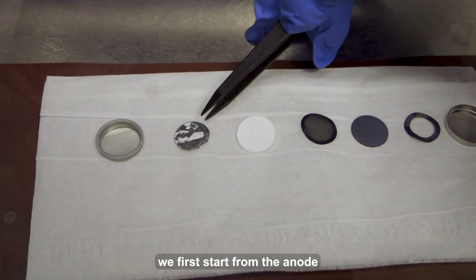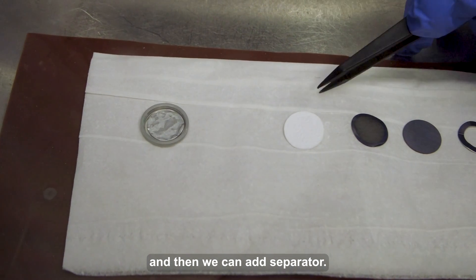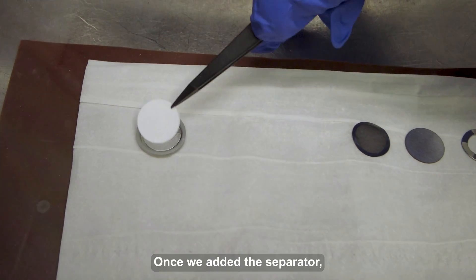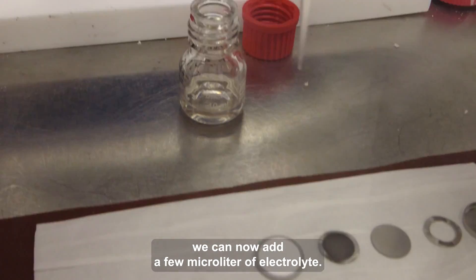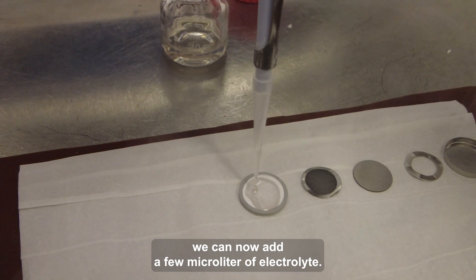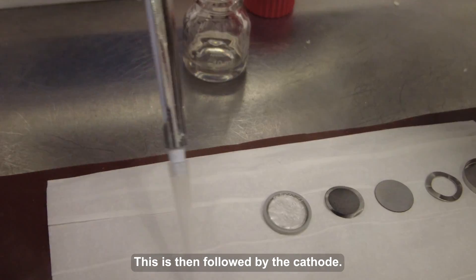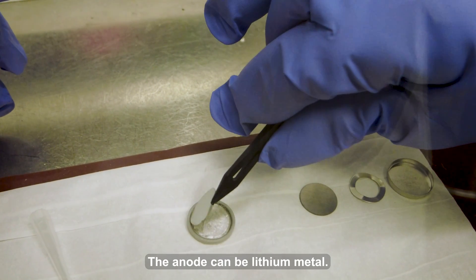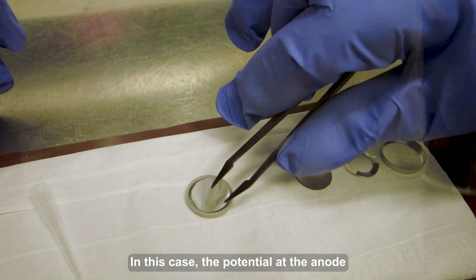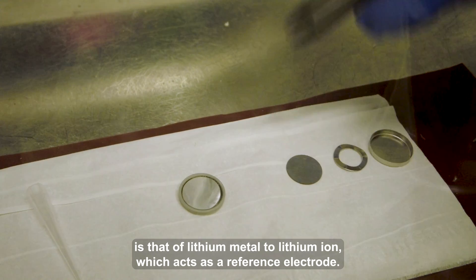To assemble the coin cell, we first start from the anode, and then we can add the separator. Once we have added the separator, we can now add a few microliters of electrolyte. This is then followed by the cathode. If testing the battery in a half-cell configuration, the anode can be lithium metal. In this case, the potential at the anode is that of lithium metal to lithium ion, which acts as a reference electrode.